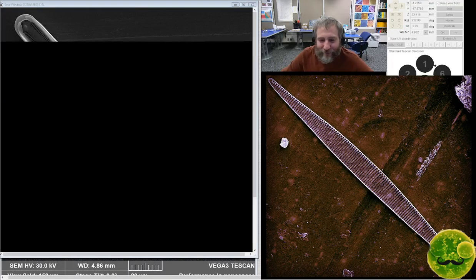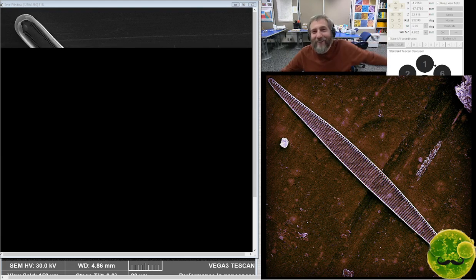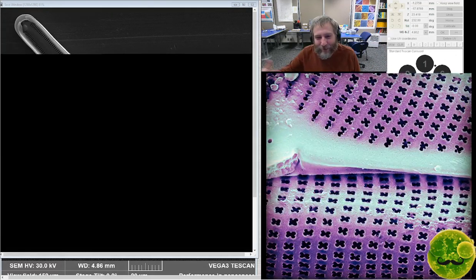Playing with gold sound, it's less fun than you think, Cobalt. I put it in the machine over there, and then I start a timer and push some buttons, and it comes out a little bit more gold than it went in.